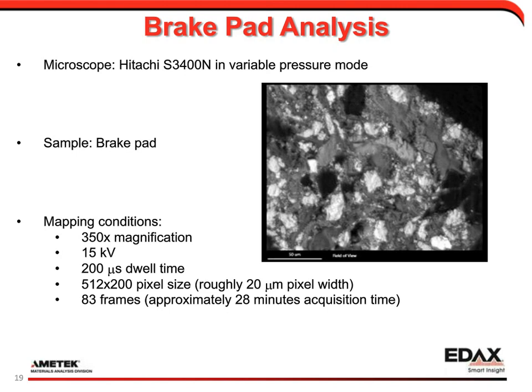There's another question about the beam size and the focus. How does that affect my X-ray quality? That one is a little tricky. It depends on what size features we're looking at. The X-ray quality isn't affected really by the sharpness of the image. Our X-rays will still be generated. We'll get the same amount of counts whether we're in focus or not. What will change is the spatial resolution of our X-rays a little bit. In most cases, it doesn't matter too much.